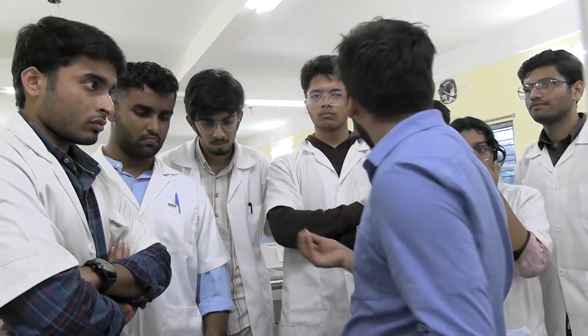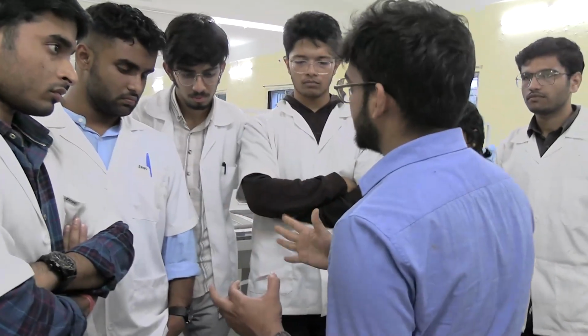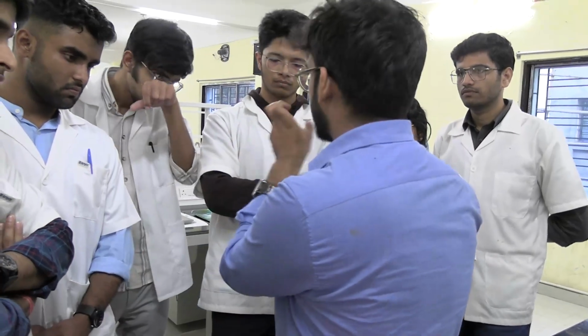First, in low power focus, you are going to find the perfect place where I am going to place my oil immersion. Oil immersion is the 100x one. In the 100x oil immersion we have to focus for the DLC. In low power only you are going to see for yourself. Okay, this is the best way. I have focused it here now.